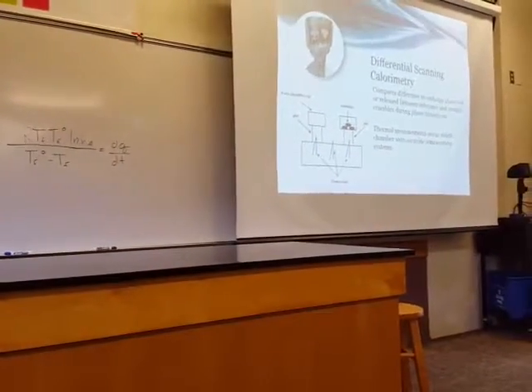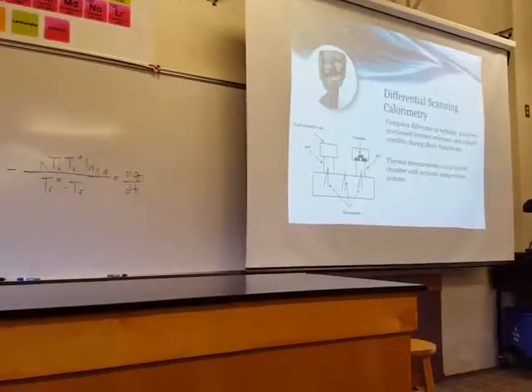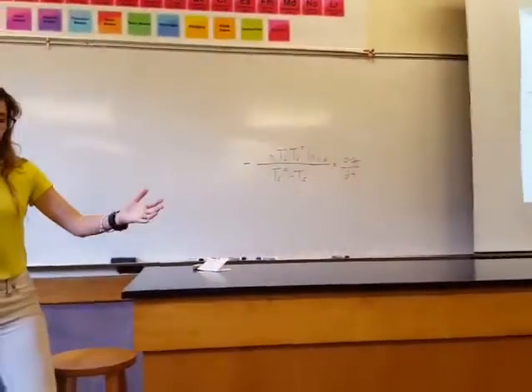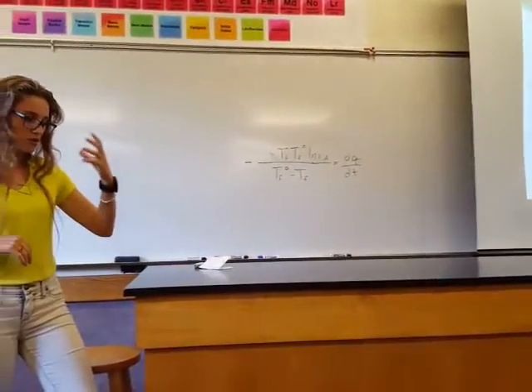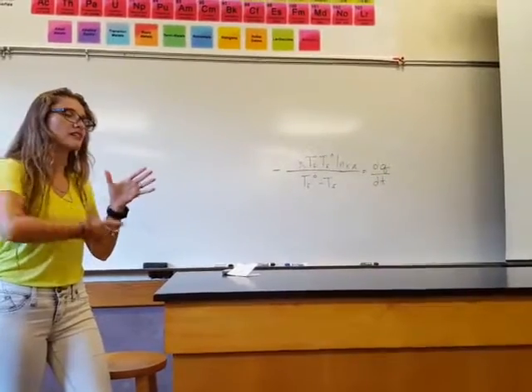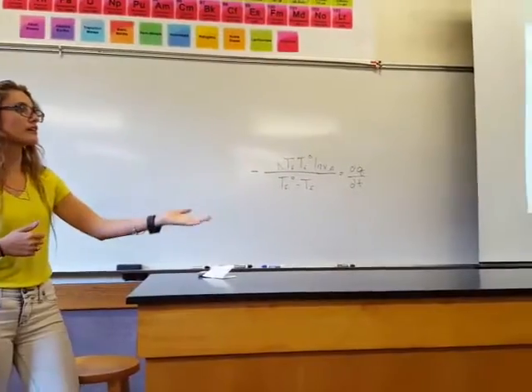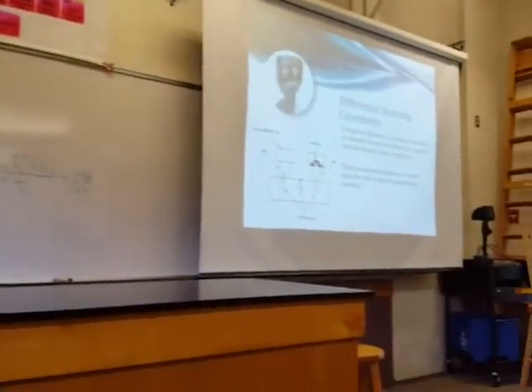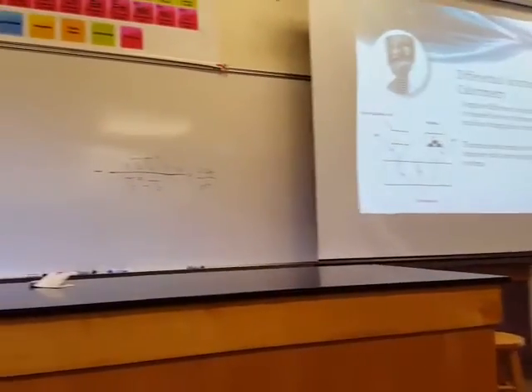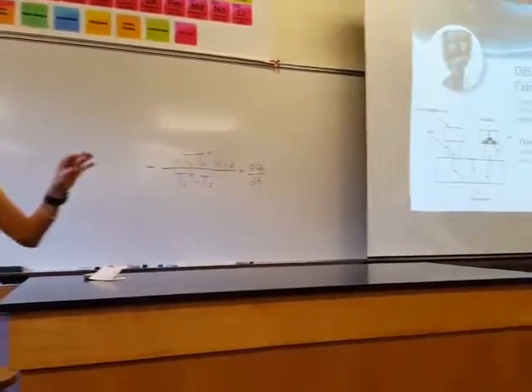Yeah. Okay, so just a very basic overall understanding of the differential scanning calorimeter. It's a machine that is able to get a lot of information by inputting a heat flow to get a more physical understanding. A major part of it is comparing the difference of enthalpy between a reference sample and a sample. And by doing this, it's able to create thermal measurements.